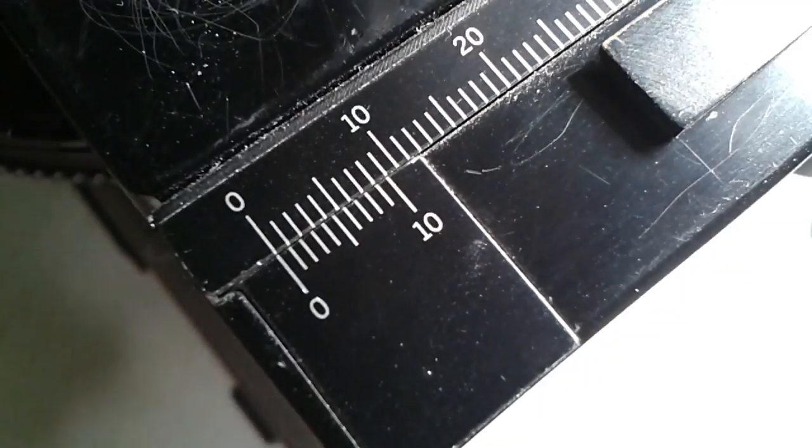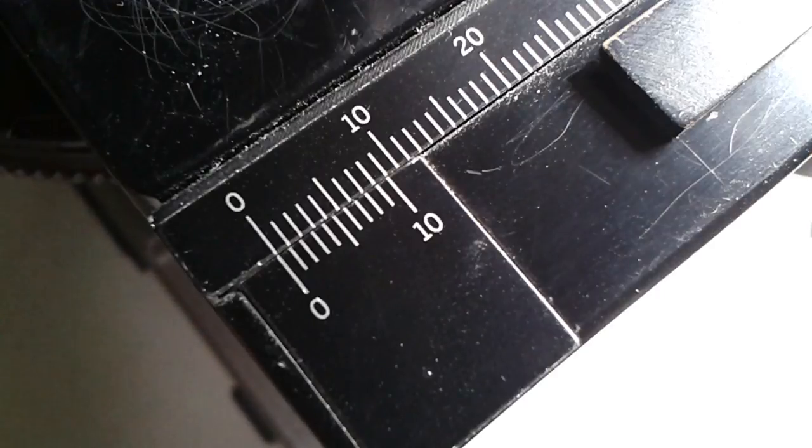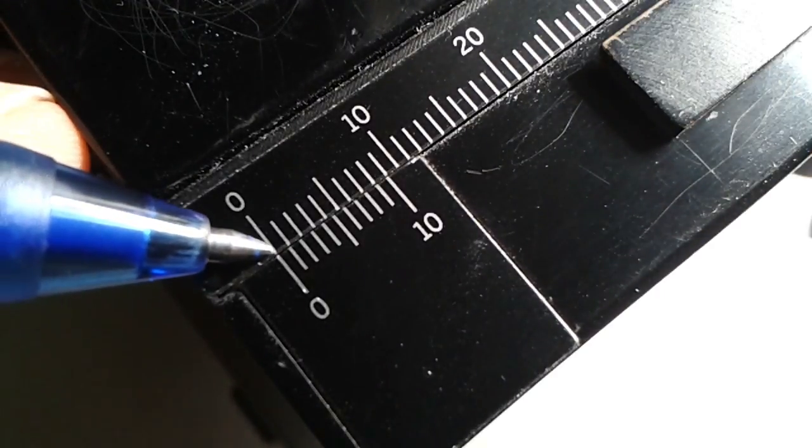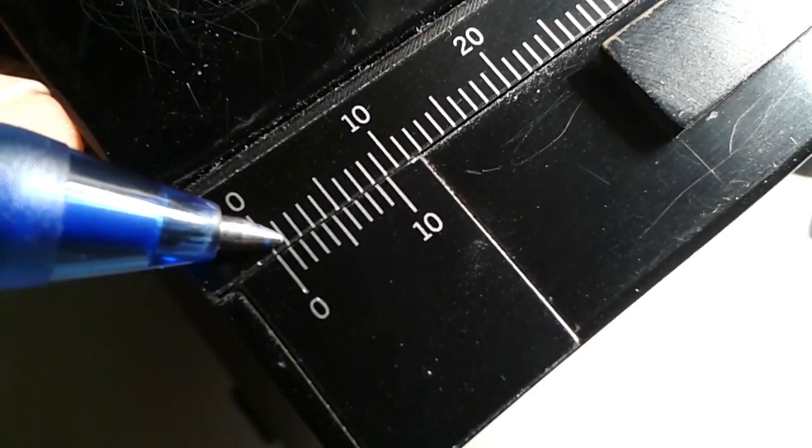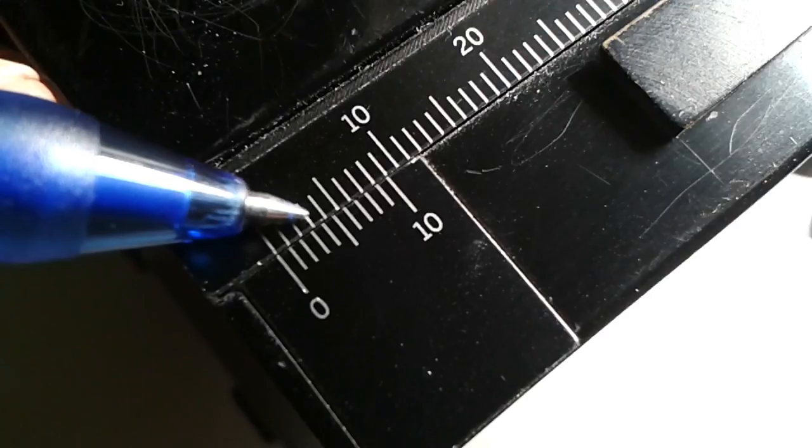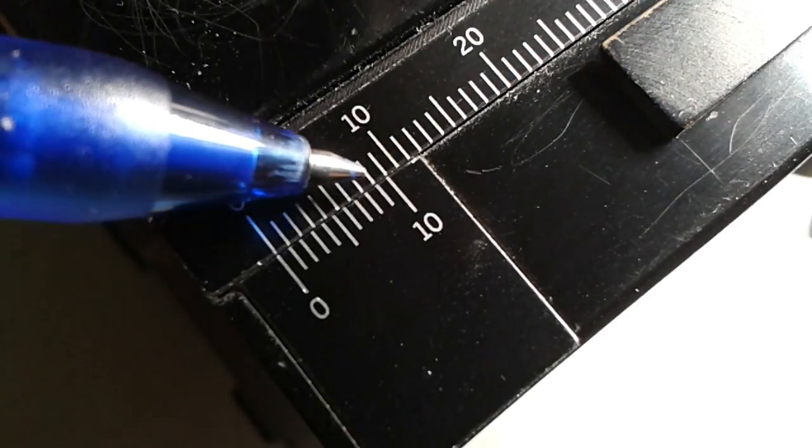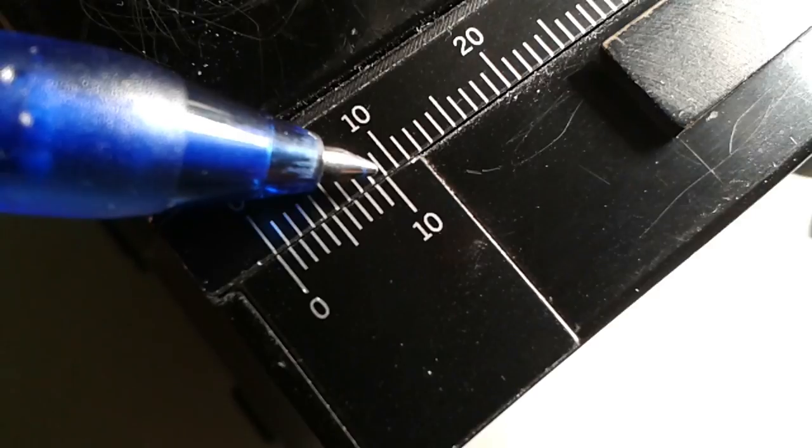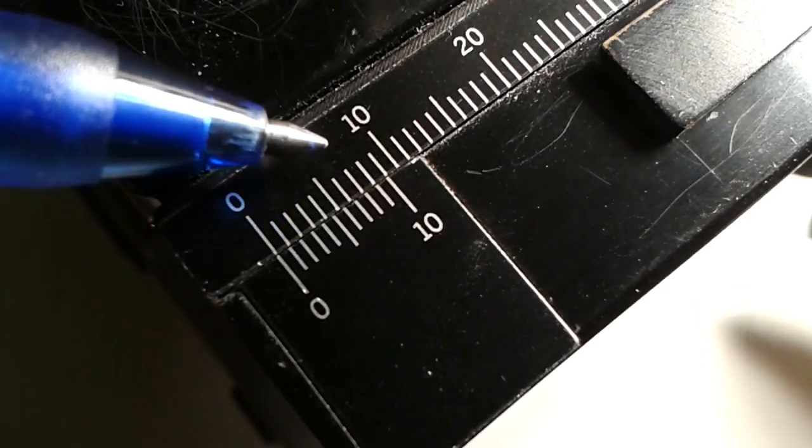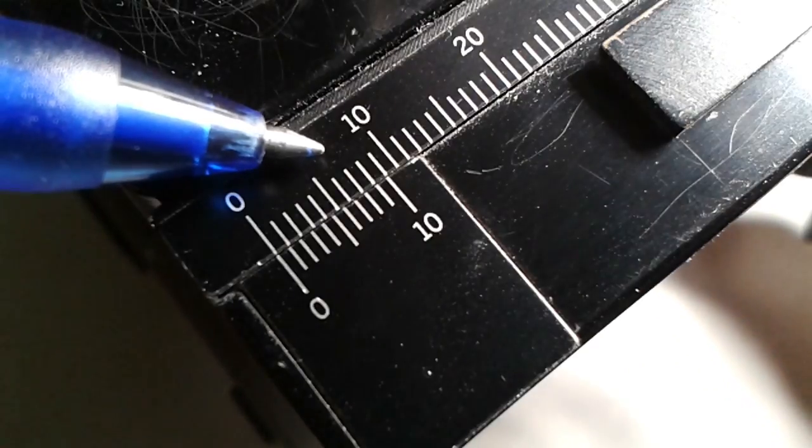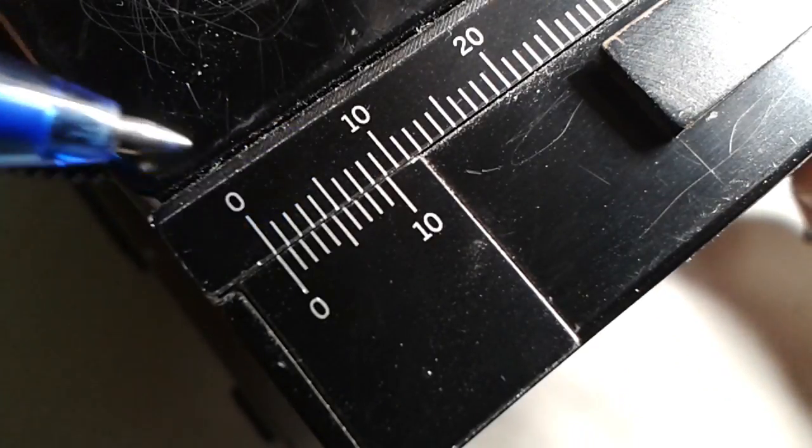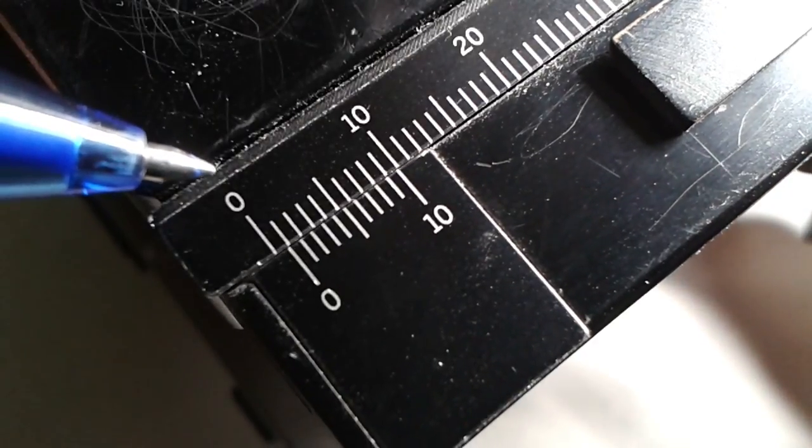It still goes all the way to 10 but the lines are closer together. And what you can see now in this case, when the zeros are aligned, all of the other lines do not match up. So they're always shifted in relation to each other. In this case the zero line and also the tenth line on the smaller scale, they are lined up, so value number 10 on the smaller scale is lined up with 9 on the larger scale, but all the other lines are not lined up and that is an important concept.